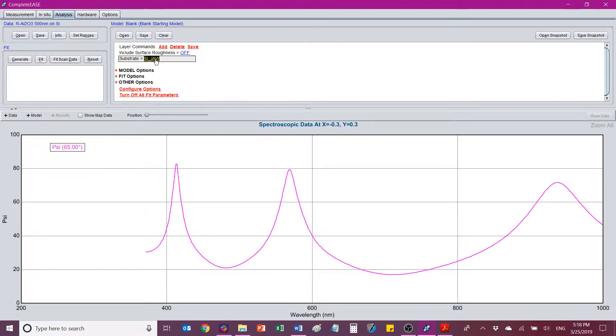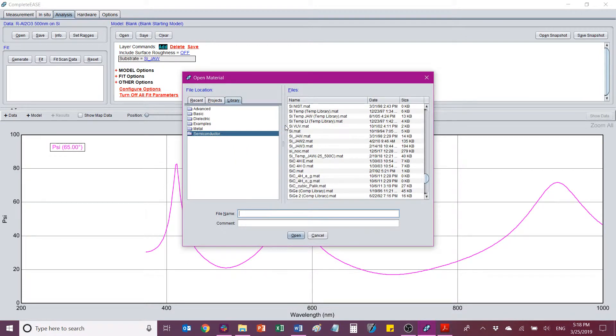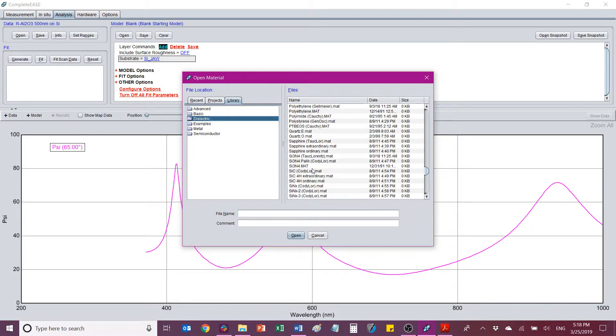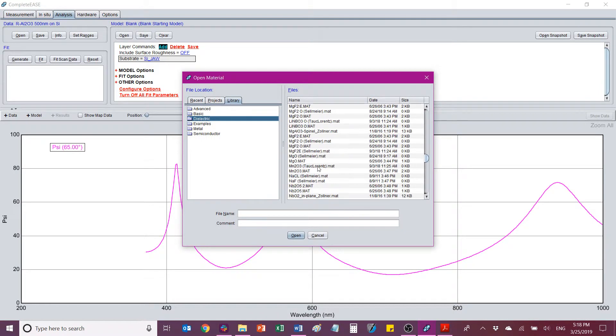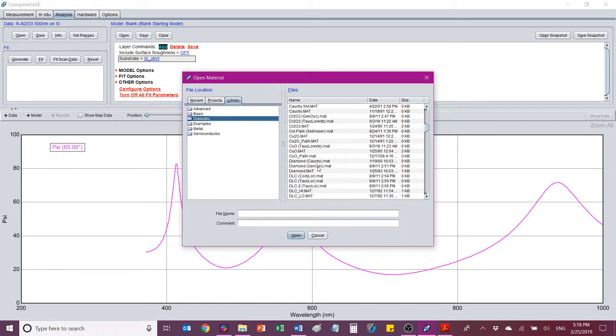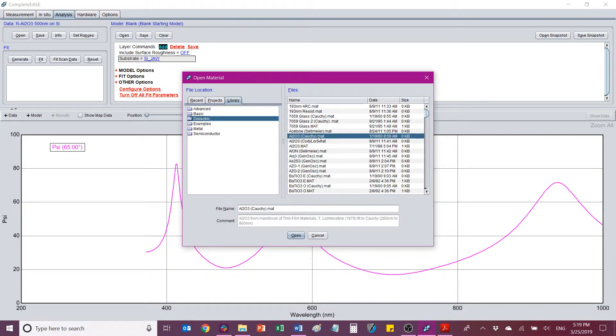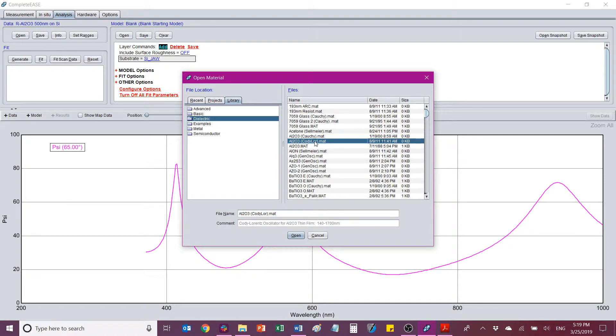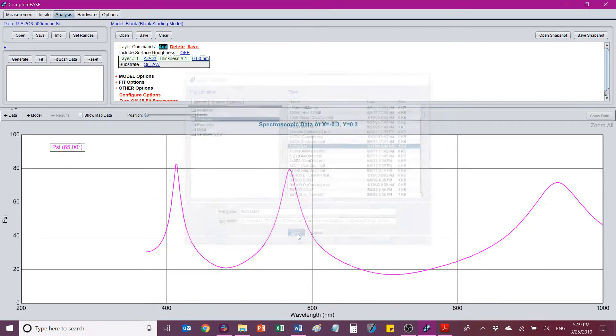So if I go to Add, I can choose where I want to put the layer, either above or below. I'm going to put it above. And then I'm going to go to dielectric. Now I know this is aluminum oxide, so I'm going to go see if we have a model for aluminum oxide. Okay, we do. We have a few of them. We have this one that says Cauchy in parentheses. This one that says Cody Lore for Cody Lawrence. That's a type of oscillator. And then there's just this one that says AL203.mat. And you can see in the comments it says AL203 data from handbook of ultra-thin films. So this would be a tabulated data file. So let's just try that.